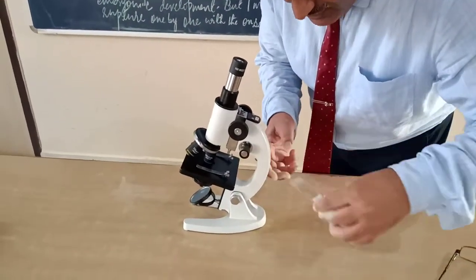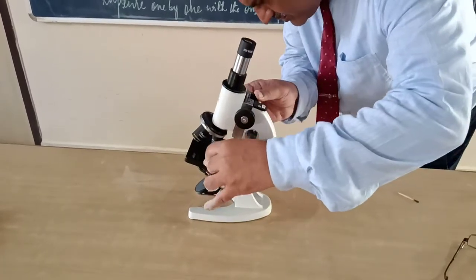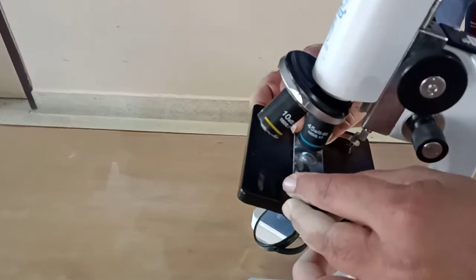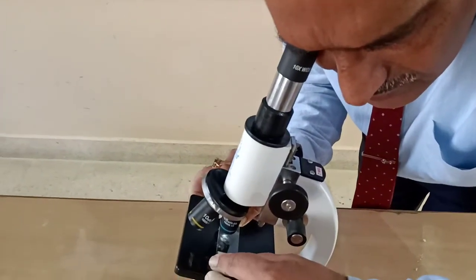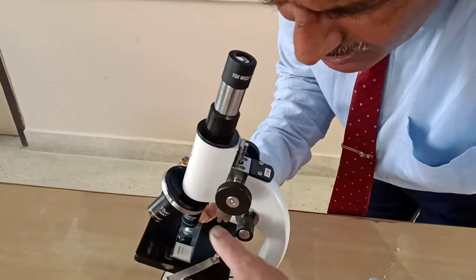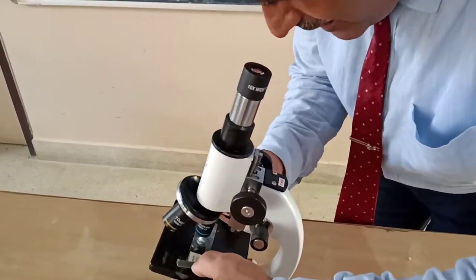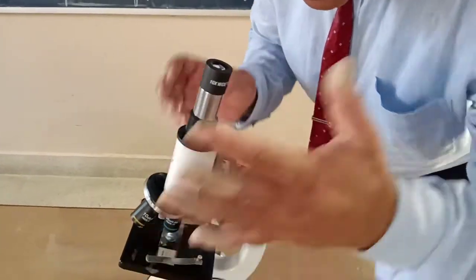We have to place this slide on the stage of the microscope. So this is the stage of the microscope. I have placed the slide, and then we can fix the slide with the help of stage clips. With the help of these clips, we can fix the slide.